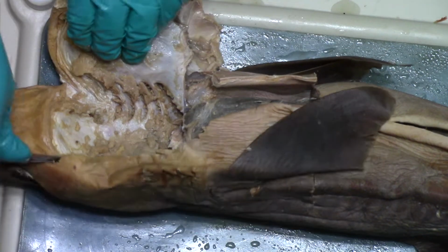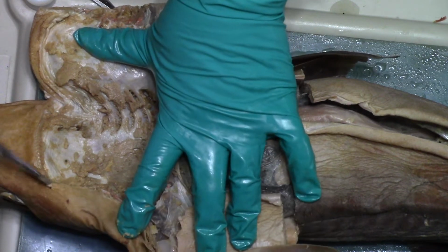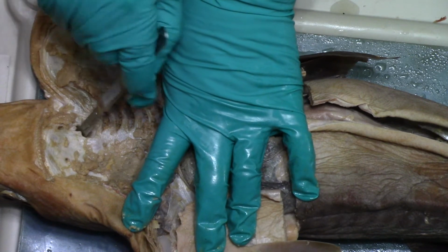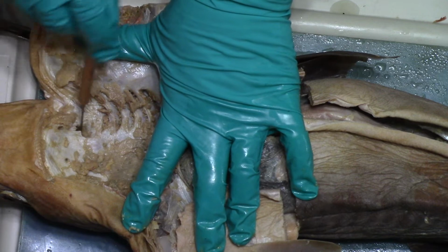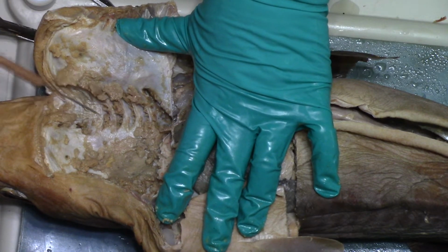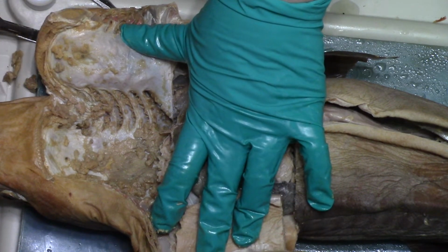So this is great. You can see, here's the spiracle. You can sort of fit the blade down in there. Where's the probe? So this is the spiracle, and that opens up into the pharynx, and here are the gill slits. Oh, it's making a mess.